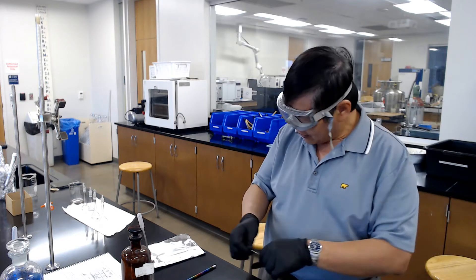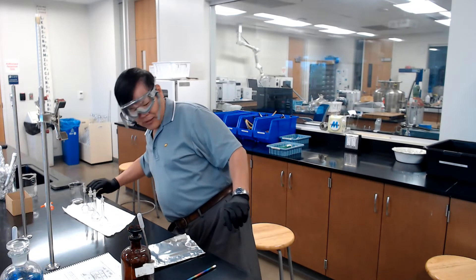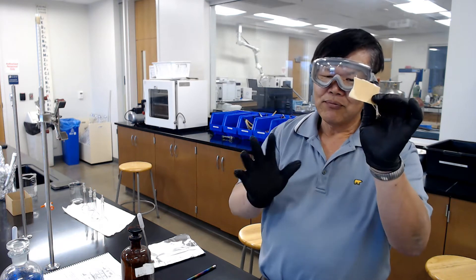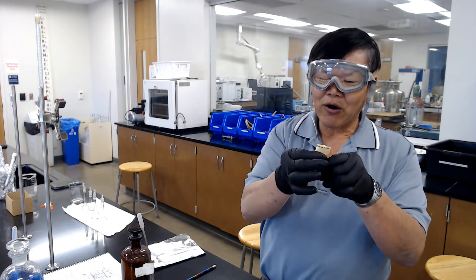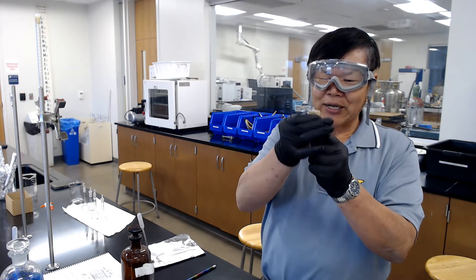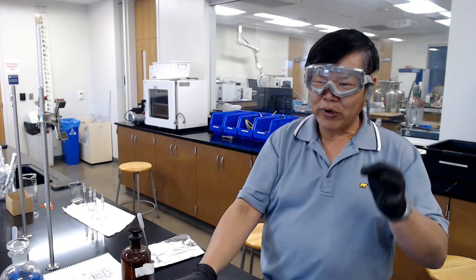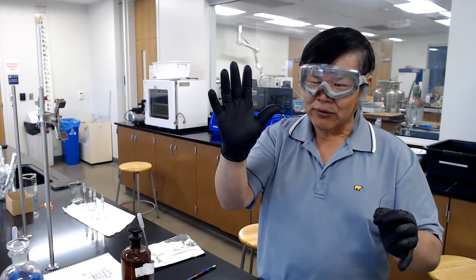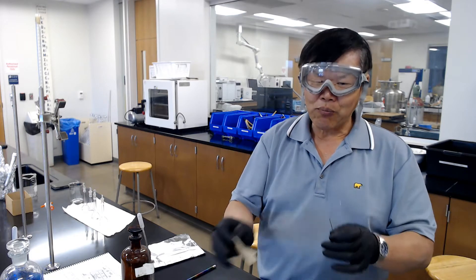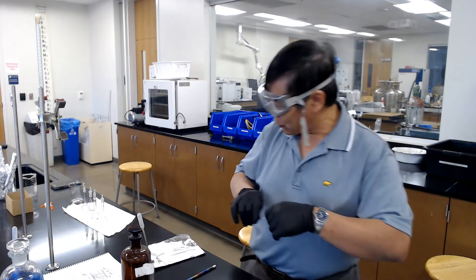Once you have the copper wires, use sandpaper and scrape off all the plastic coating until it's like a shiny penny. Hey, you'll notice I'm wearing goggles as well as gloves. The reason you wear gloves is so you don't cut your hand when you're doing this sanding.